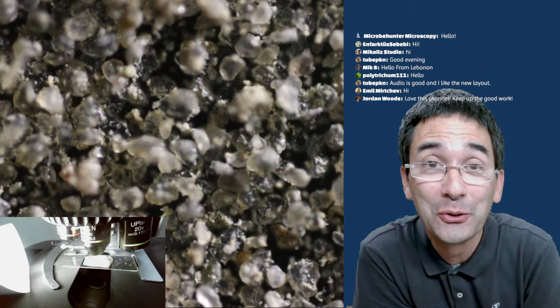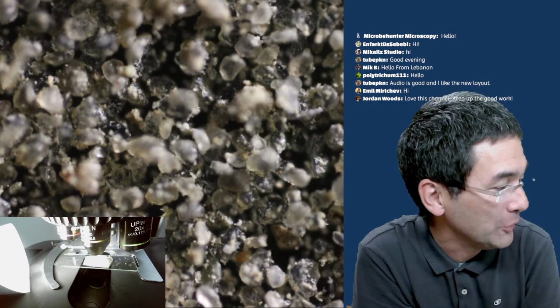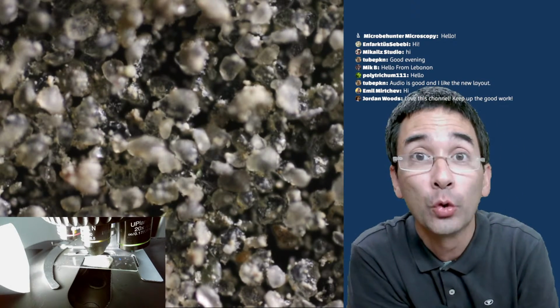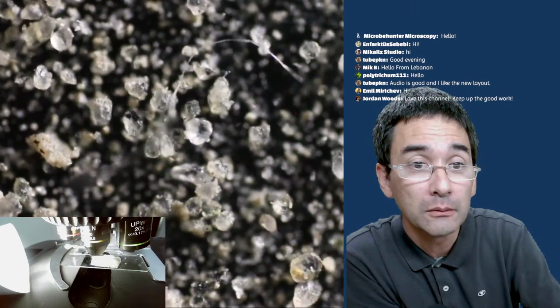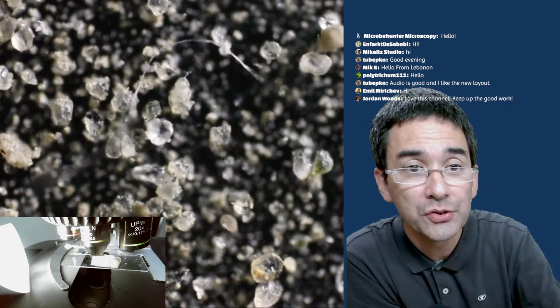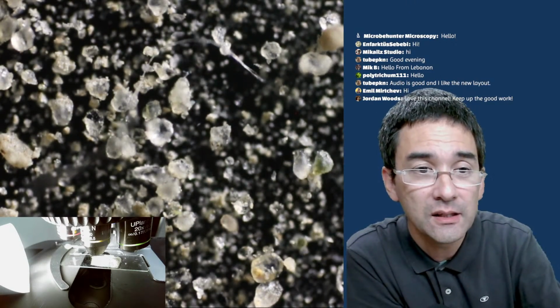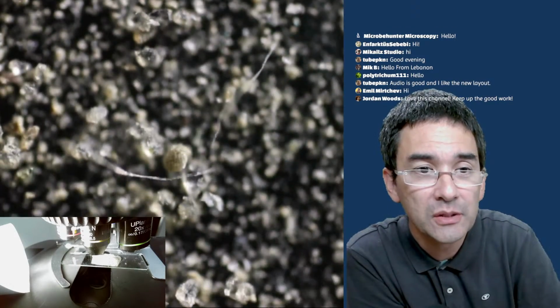So today I'm not going to do anything complicated. I just want to show it to you to motivate you a little bit, maybe also to try this out, because that's actually a way that we normally do not use compound microscopes. Okay, but that is essentially the sand from the top, and by focusing, you see that if you use the low power objective, then the depth of field in most cases is large enough that you're actually getting most of it in focus. You see that there is of course also some dust here.